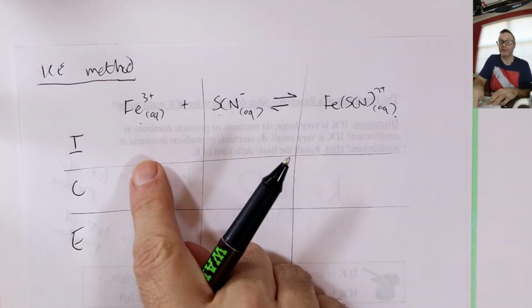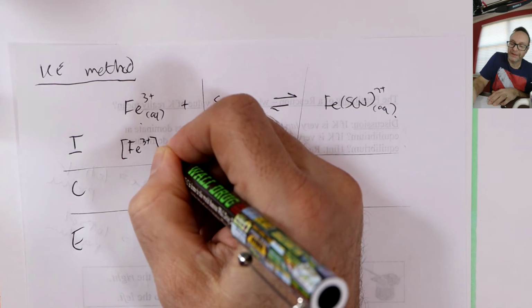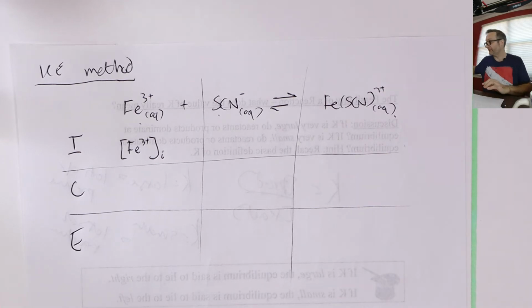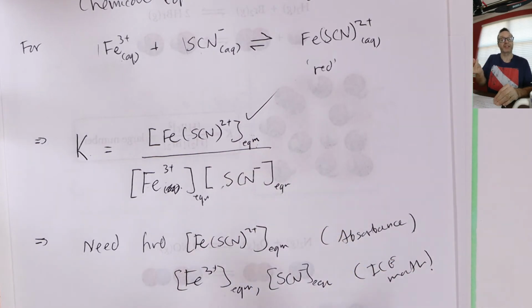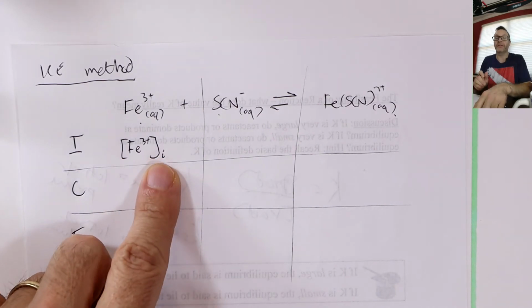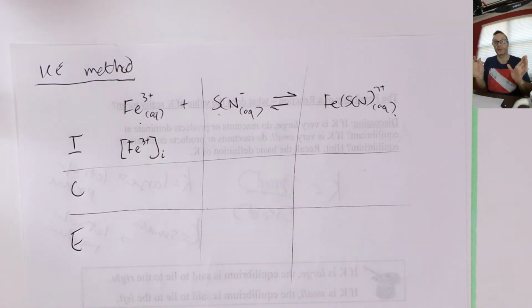All right, now, if you think about it, because you're mixing these from two test tubes, right? You set this up, you set the initial concentration. So I'm going to write it symbolically, and this is why it's important. If you remember that first one I did, I had EQM, right? So if I go back real quick. Concentrations at equilibrium, right? That's when it's finished its reaction, yeah? When we set this thing up, we use the subscript I here for initial, right? So you always know the I value, right? Whatever that concentration is. Maybe it's 0.1 mole per liter or something, whatever it is.